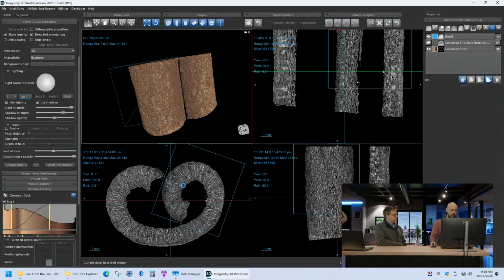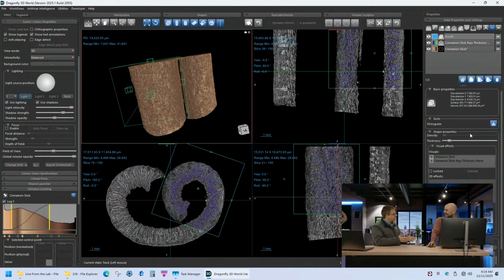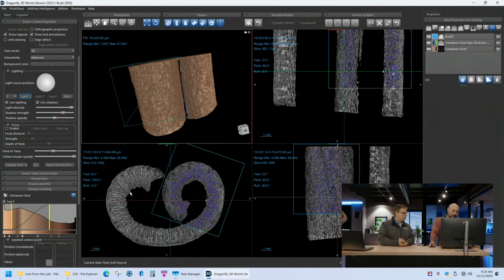these brighter features, they're called rays. We looked this up, we had to figure this out. Phloem rays, phloem with a P. Geologist, not a biologist, so that's what we had to learn. That's the journey of discovery you have with a tool like this. As you look at it and you go, "What's that? I haven't seen that before." So it's really interesting.